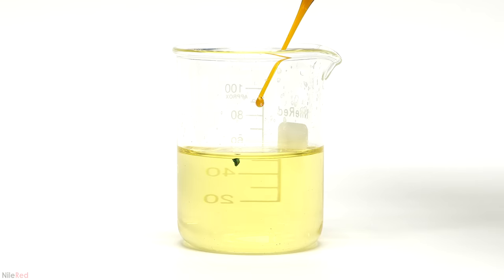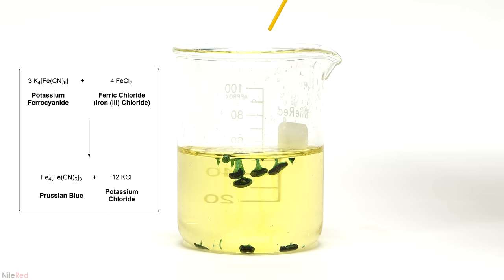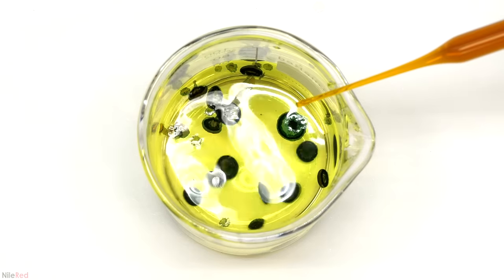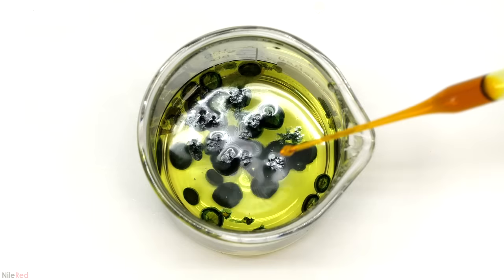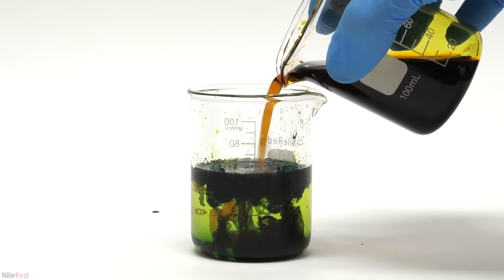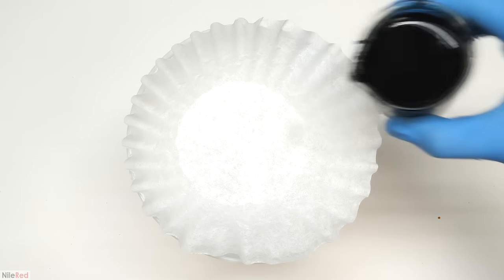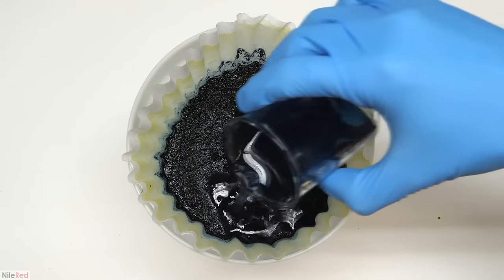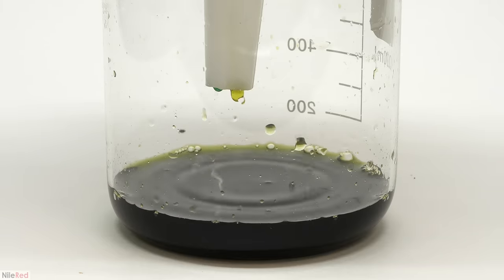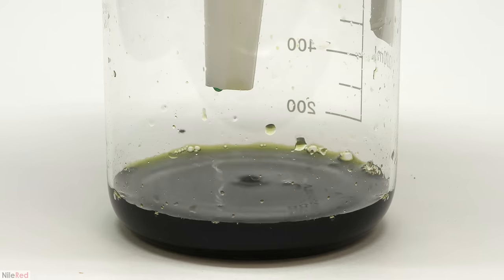I had normally just directly poured the iron chloride solution in, but I instead added it drop-wise because I thought it would look cool. The moment it was added it immediately formed some little greenish-blue donuts of insoluble Prussian blue, and also made potassium chloride as a side product, which just dissolved into solution. From the top, each drop kind of looked like little jellyfish. I continued playing with it but when I eventually got bored I poured in the rest and stirred it for a few minutes — so much Prussian blue was made that it got quite thick. To separate it off I used a coffee filter, poured and scraped out as much as I could, washed the beaker with water, then kept washing the pigment until it was a greenish blue, which took about 4 rounds. The first few washings were tainted with a yellow color from the excess iron chloride.